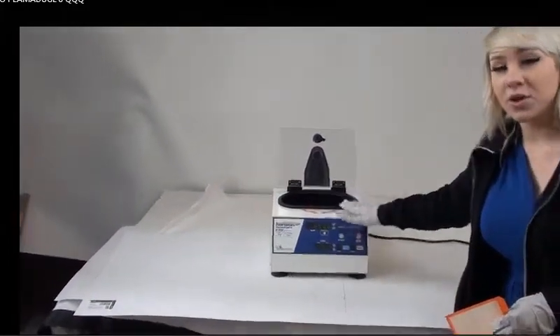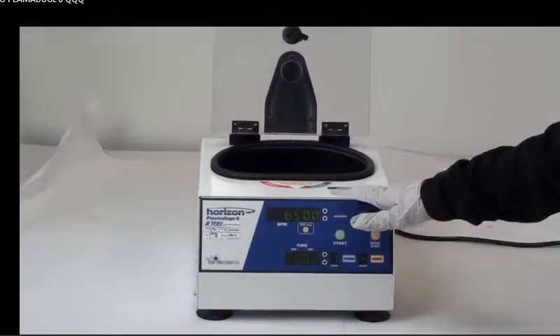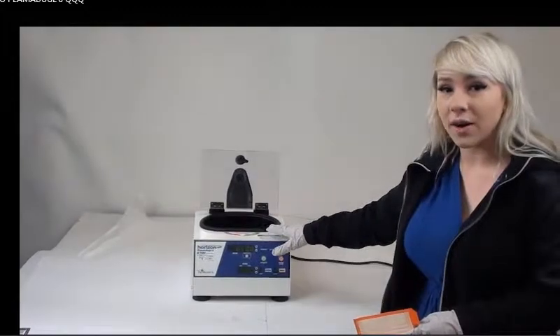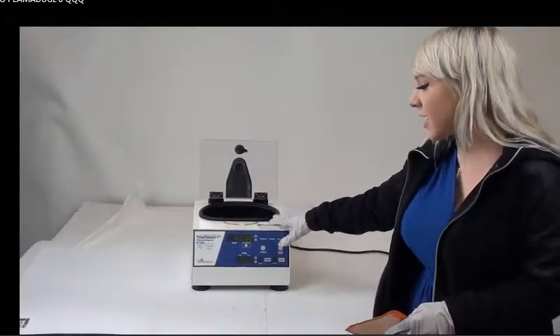This is a calibrated piece and we do have many in stock right now. If you're interested, please visit our eBay page at MyCyberOfficeID or MyCyberOffice.com.